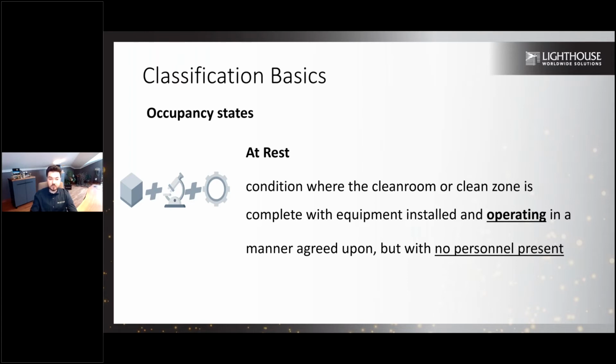That's why in at rest condition, we want to see this part without any personnel. So if your personnel will leave the particle counter inside the room, in order to make it at rest, you should use the delay mode, and your operator will move out of the area, and the particle counter will stay in a delay mode for a couple of minutes, then will run in at rest conditions.